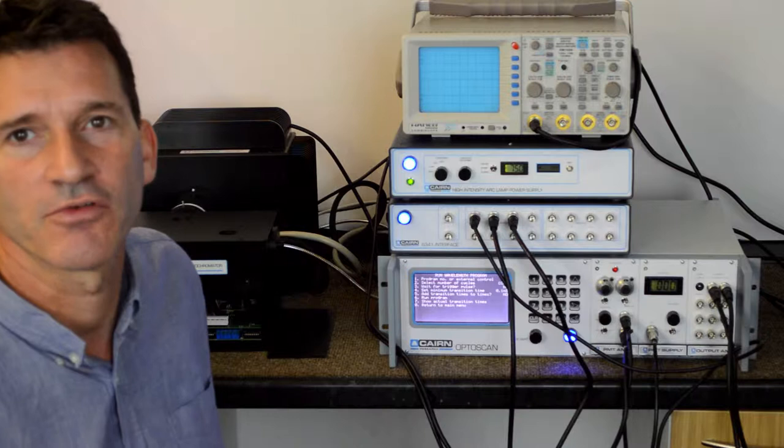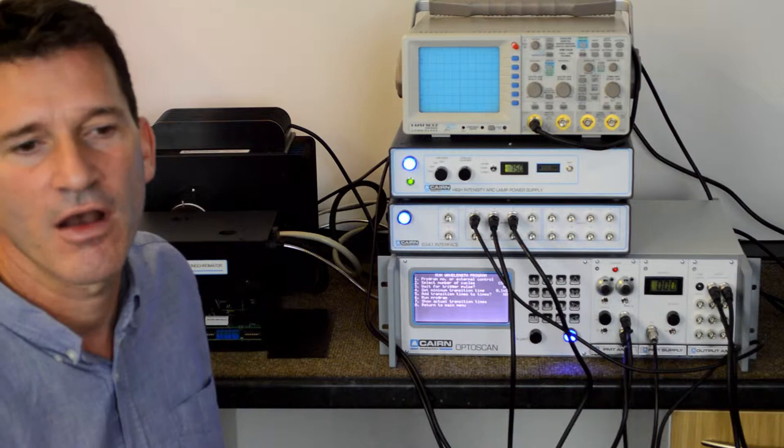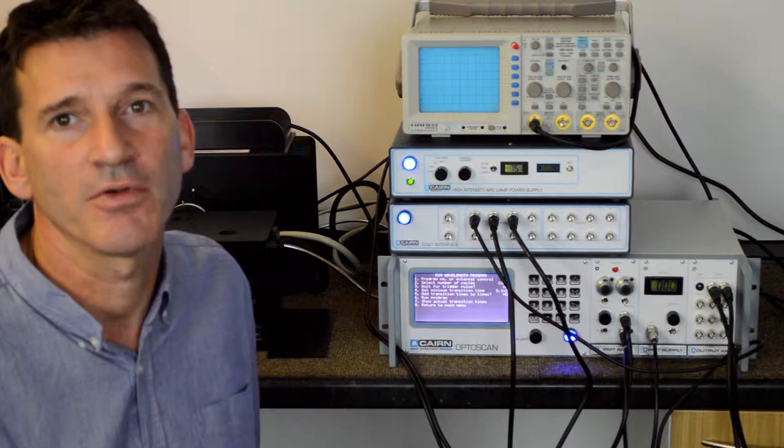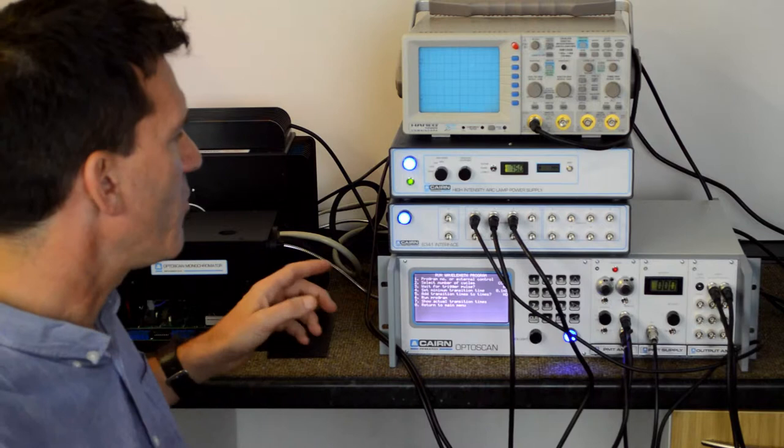I'm going to explain today how to set up a FURA2 experiment using the Cairn OptoScan monochromator in integration mode. We've already set up a program to run between 340 and 380 nanometers with appropriate time resolution and bandpass to get signals at the level that I want to record.